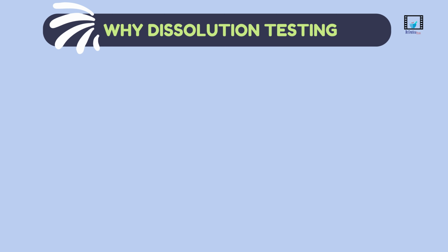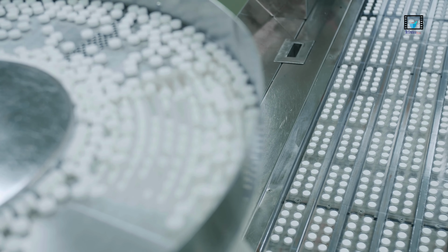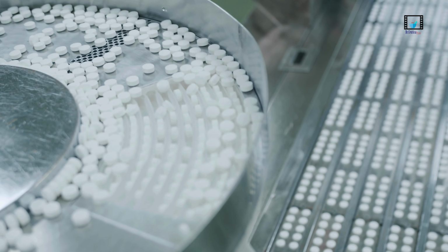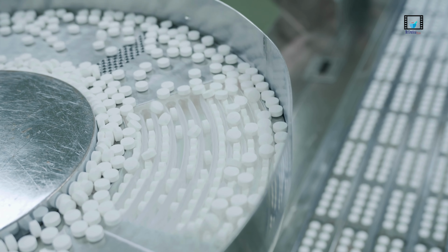So why do we test dissolution in the first place? First, for quality control, dissolution ensures every batch performs the same way and that the medicine you take today behaves just like the one you took last month.